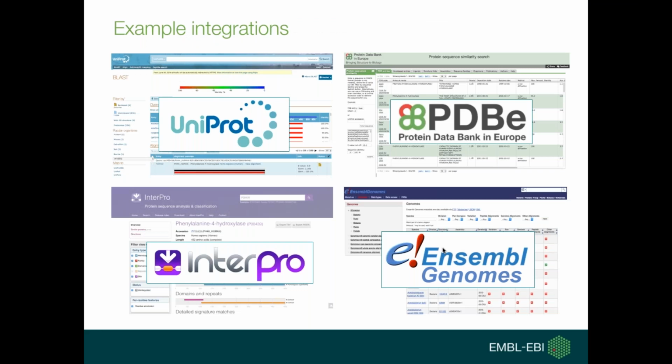Just a quick mention of known resources from the EBI, such as UniProt, Protein Data Bank in Europe, and Ensembl Genomes, which use our web services in their resources. Like, they provide BLAST search engines in their pages that in fact use our web services. Another resource that uses the web services we provide with Job Dispatcher is InterProScan.